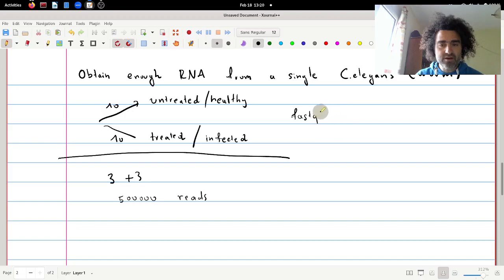Typically, their RNA data here have approximately 20 million reads. Each FASTQ file contains approximately 20 million reads. Because all this will take some time, I just truncate it.